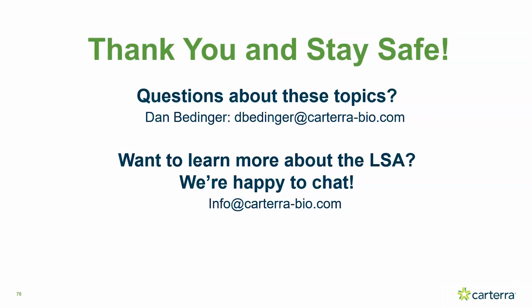Okay, another question. Does the relationship between size of the ligand to be immobilized and the RUs immobilized to reach desired ligand density? Sorry, can you read that one more time? A question regarding the relationship between the size of a ligand to be immobilized and the RU. Yeah, so I think this is basically similar to the stoichiometry question, the mass ratio.